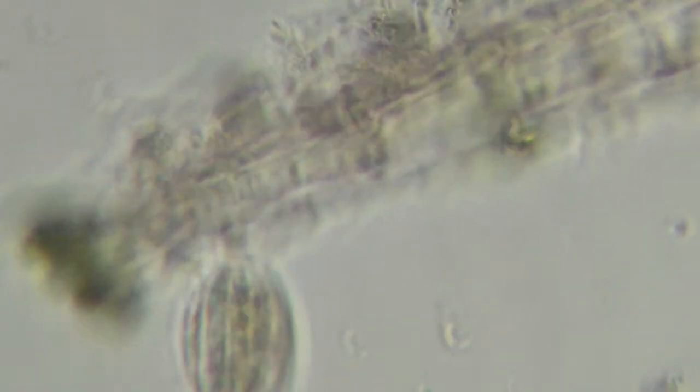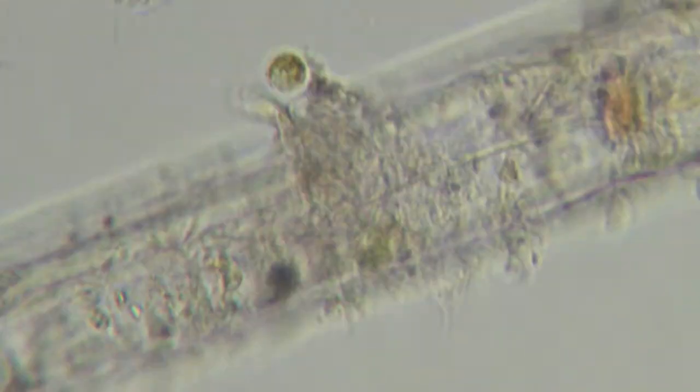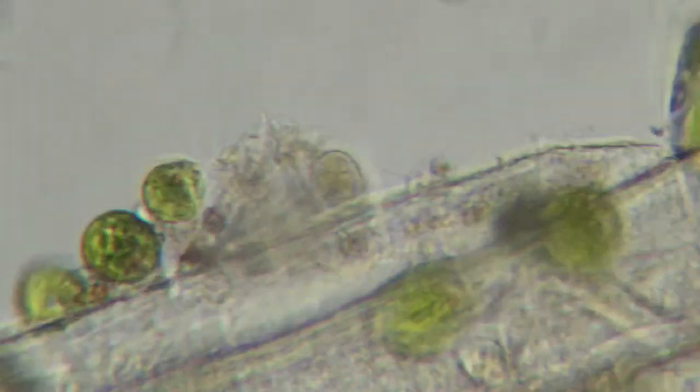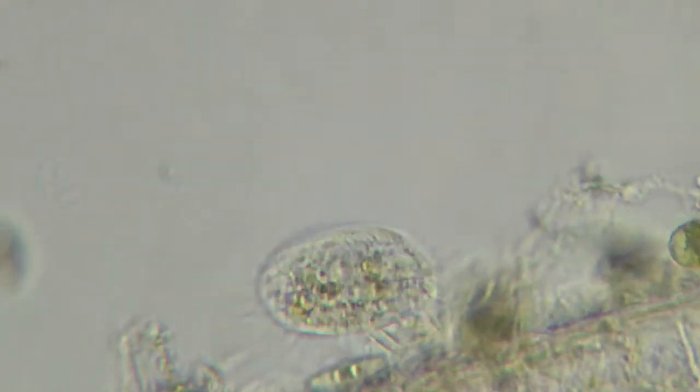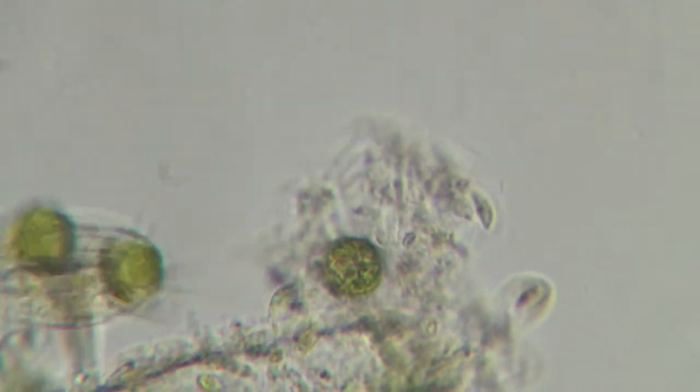I never saw any cilia do this, except for this guy. These are so fun. Look at that. Single cell beetle. Walking around. And when they flip over, you can see they're concave. So they definitely have an unusual structure, bilateral symmetry to a certain extent.